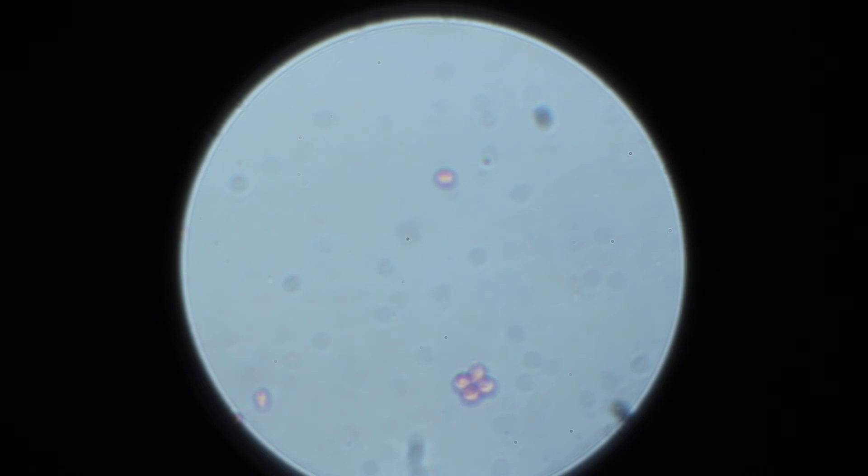So I'll go through it slowly a few more times. Starting to see a lot of detail. There we are, pretty much in the center there. Backing up — there we go, there's the center. Now we're back through it. Here you can see the sprout at the top. It comes into a little more focus by the time we get to the center.